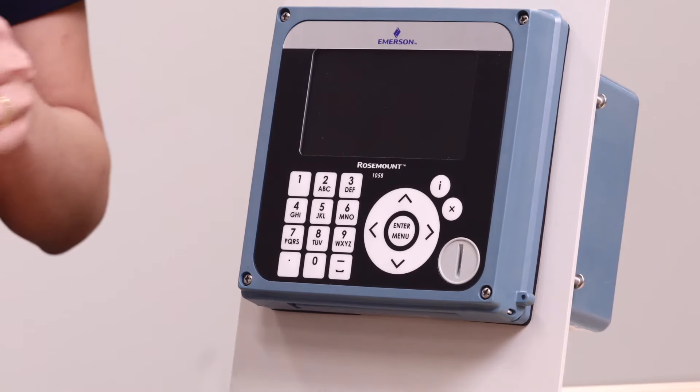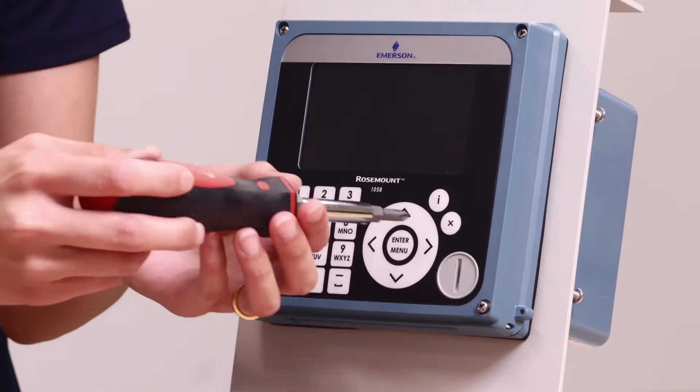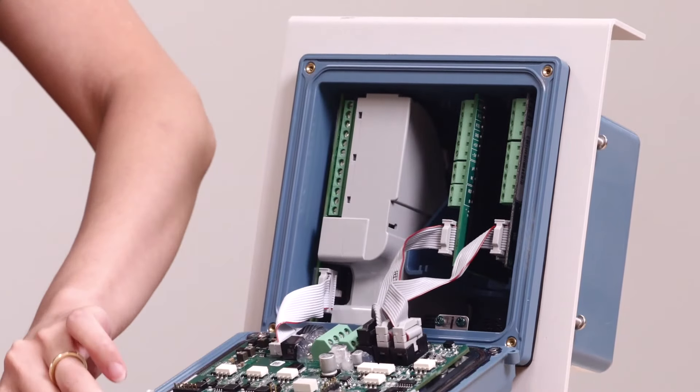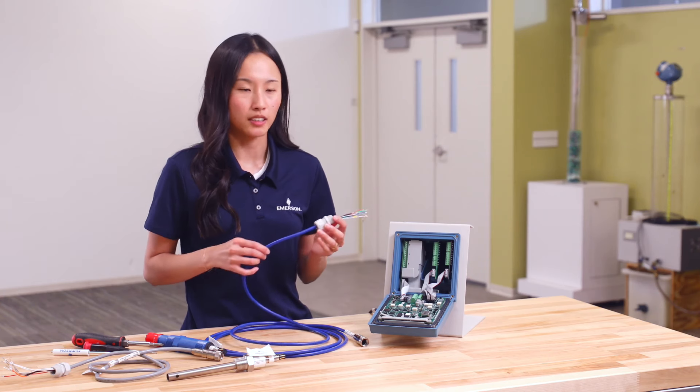With the screwdriver, loosen the four screws on the face of the transmitter, then pull down the top of the cover. Thread the ends of the wires through an appropriate cable gland, which I have already done, and install the cable gland into the transmitter.